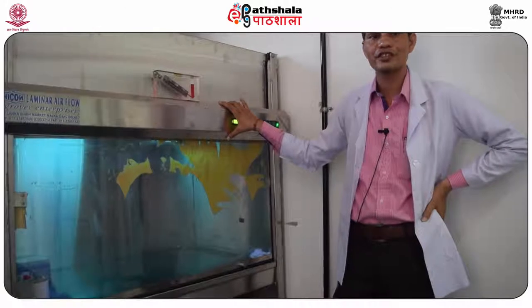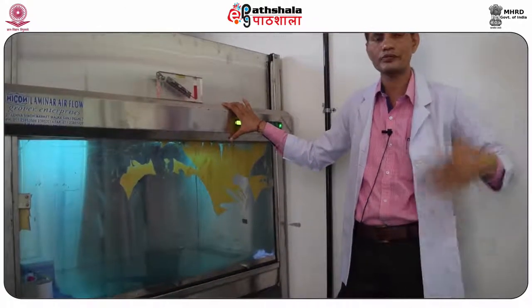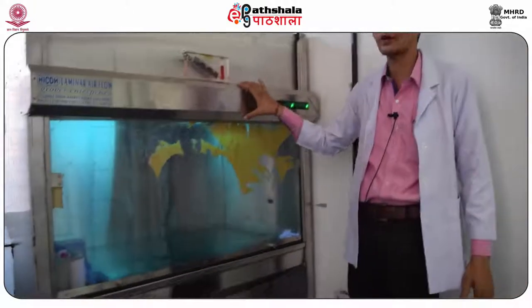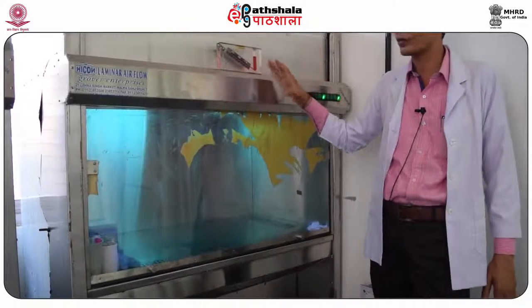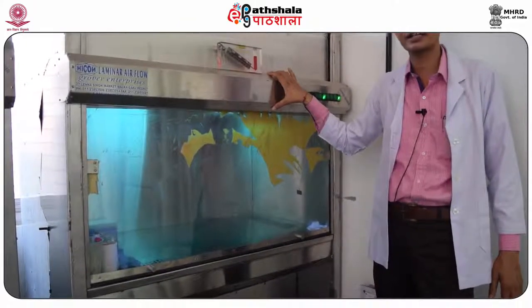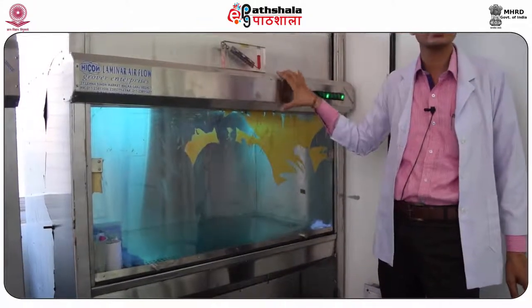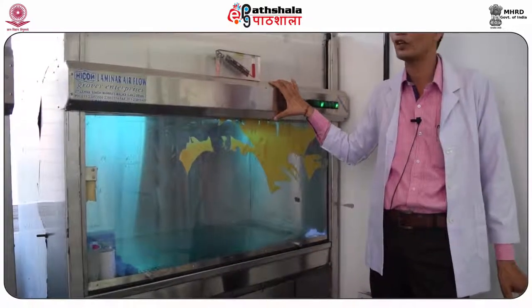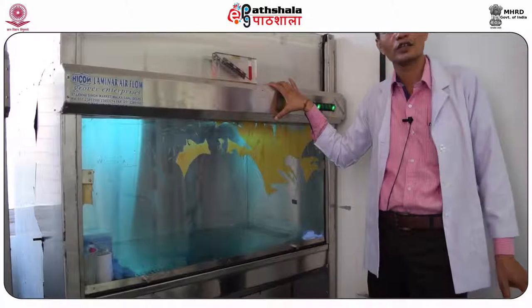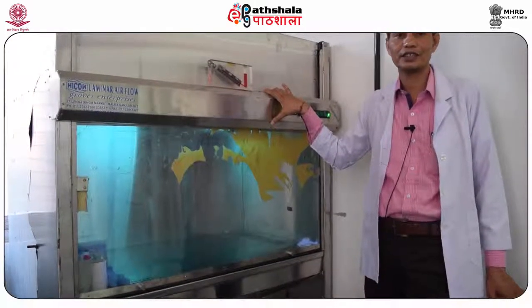In laminar airflow, sterile air flows toward the face of the person working in the laboratory, while in a biosafety cabinet, the sterile air flows in the form of a curtain. There is an air curtain developed between the material and the person. So you can handle non-infectious material in laminar airflow, and you can handle non-infectious as well as infectious matter in a biosafety cabinet.